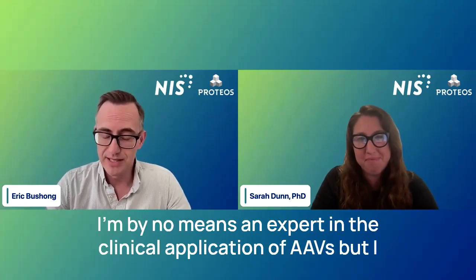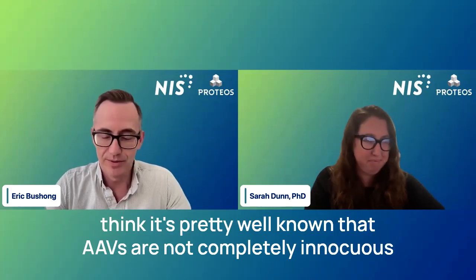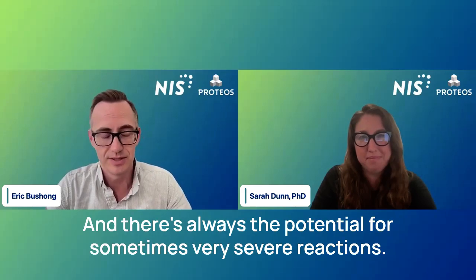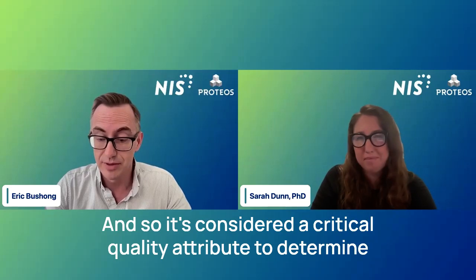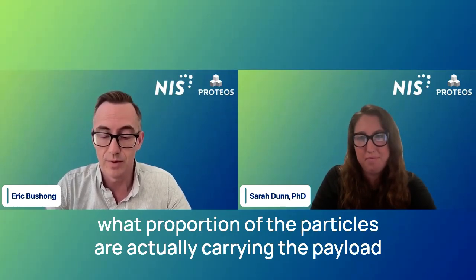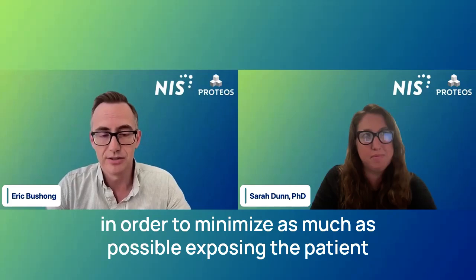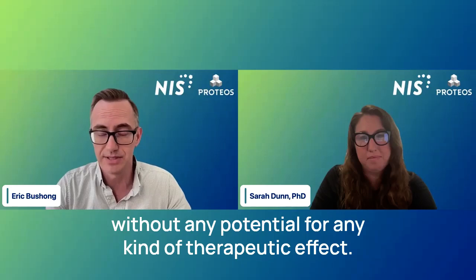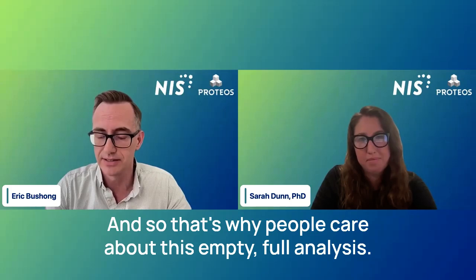Sure. I'm by no means an expert in the clinical application of AAVs, but I think it's pretty well known that AAVs are not completely innocuous when you put them in a person, and there's always the potential for very severe reactions. So it's considered a critical quality attribute to determine what proportion of the particles are actually carrying the payload, in order to minimize as much as possible exposing the patient to capsids that are potentially going to have a toxic side effect without any potential for a therapeutic effect. That's why people care about this empty-full analysis.